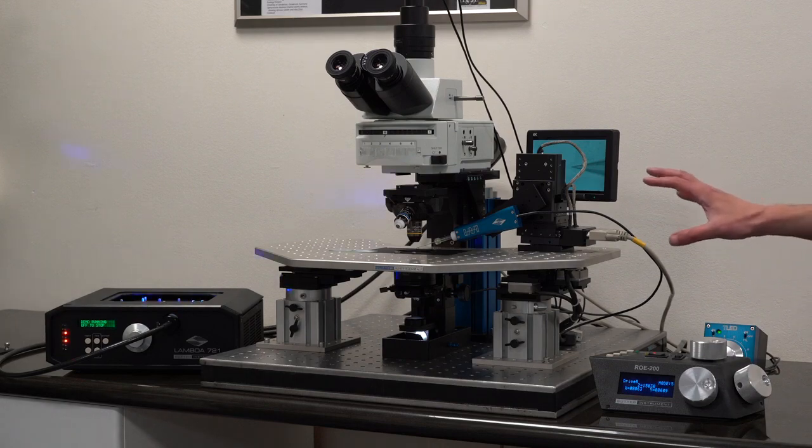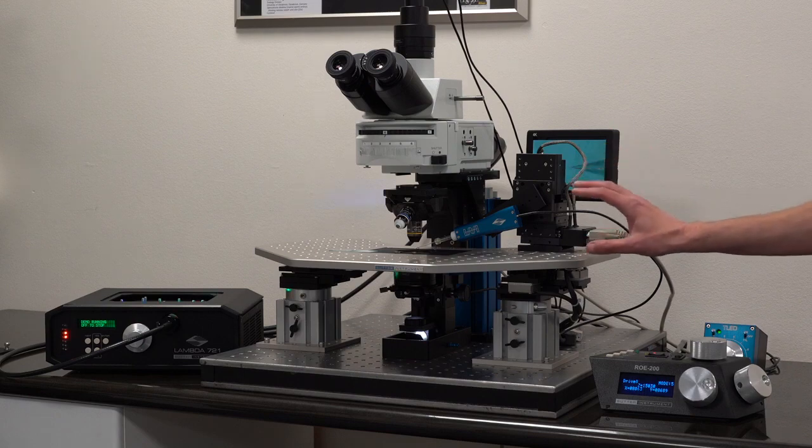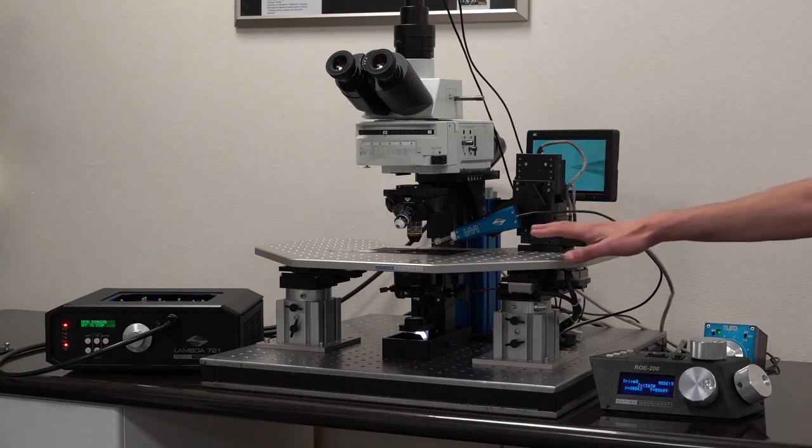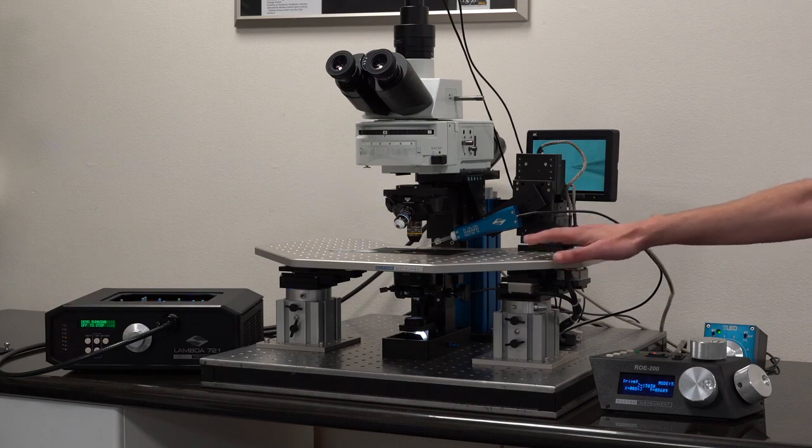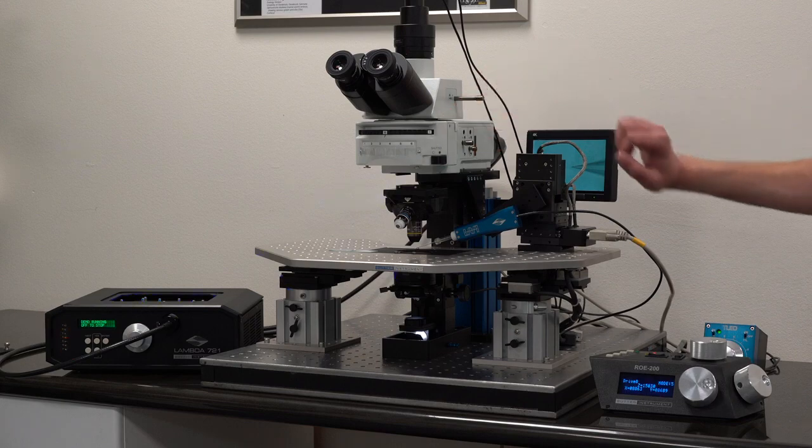In this setup, we are doing something a little bit less traditional. That means the manipulator and the stage are moving together. The microscope is sitting still.